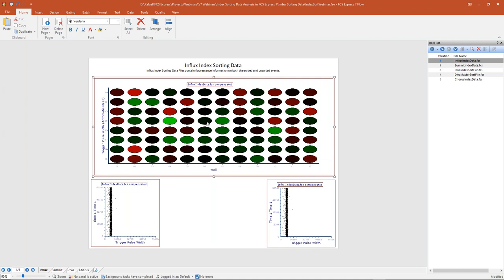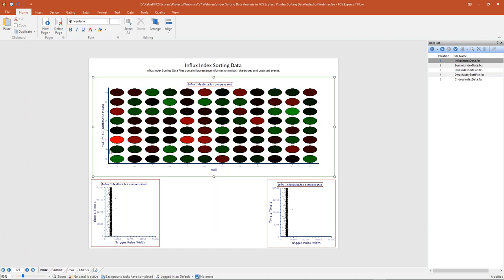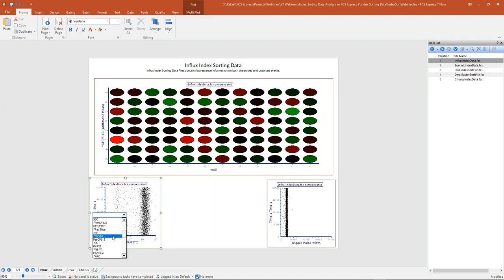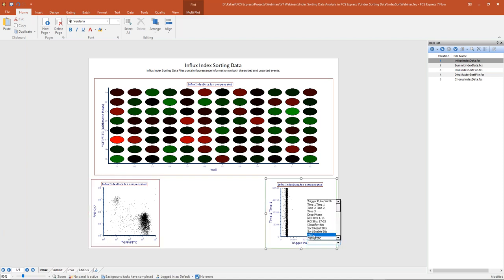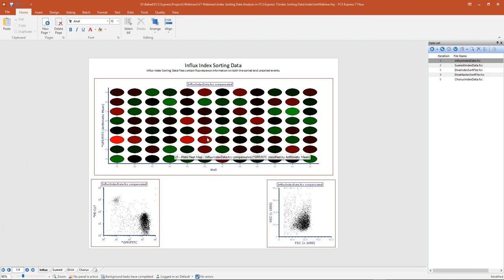The plate heat map functions identically to any other plot type. I can change my y-axis by simply clicking on that parameter. In this case, I'm going to select my GFP or FITC parameter, and those colors update to show, in this case, my arithmetic mean for my GFP — that color corresponds to that value on each of these wells. On my plot to the left, we'll look at fluorescent parameters like GFP and PE size 7, and on the right, scatter parameters like side scatter.